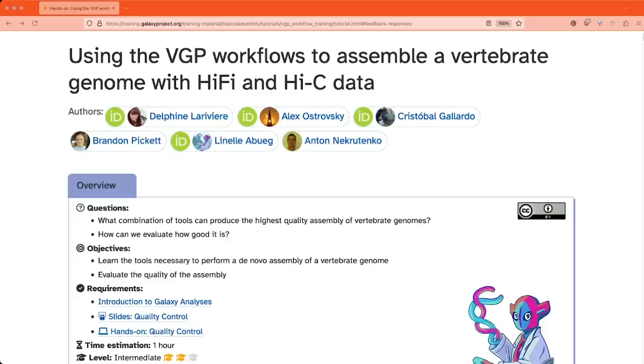Hello and welcome to the Galaxy Training Network tutorial for using Vertebrate Genome Project workflows to assemble a de novo reference genome with HiFi and Hi-C data. The goal of this tutorial is to show you the tools the Vertebrate Genome Project uses to create high-quality de novo reference genomes, and the tools VGP uses to evaluate and report on their quality.